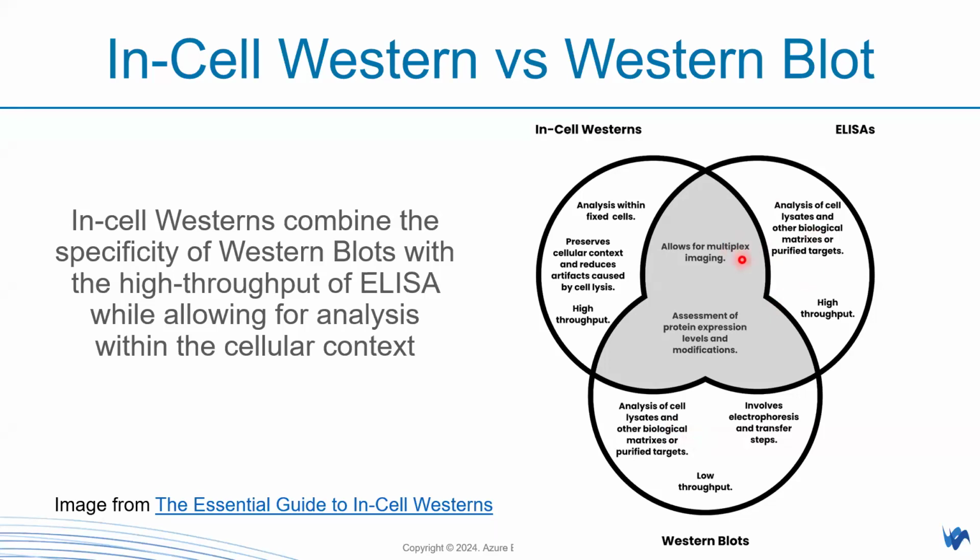So normally we use conjugates in the near-infrared spectrum, commonly used to reduce the autofluorescence signals and noise that usually associate with the plasticware that you use. That is why a glass bottom is highly recommended. Okay. So it combines the best of the two, ELISA and Western blot.